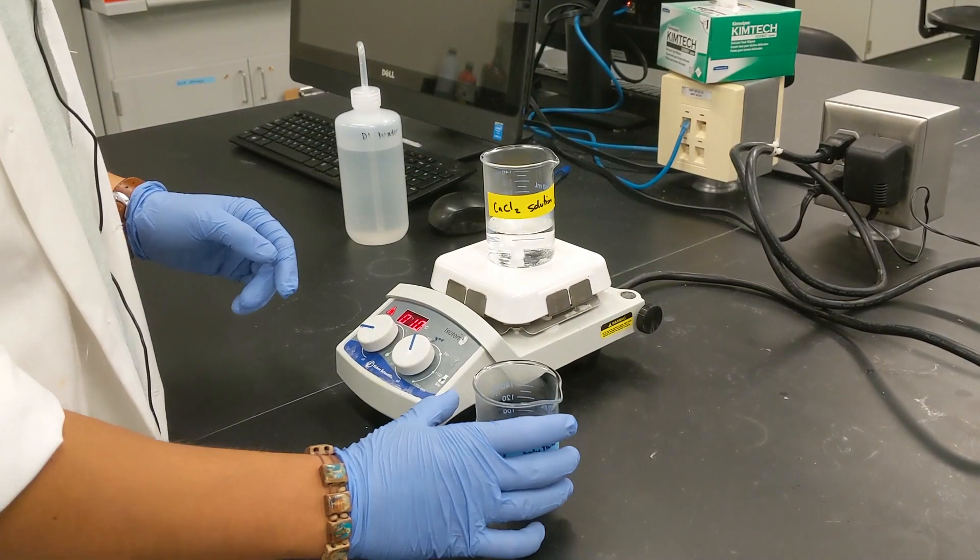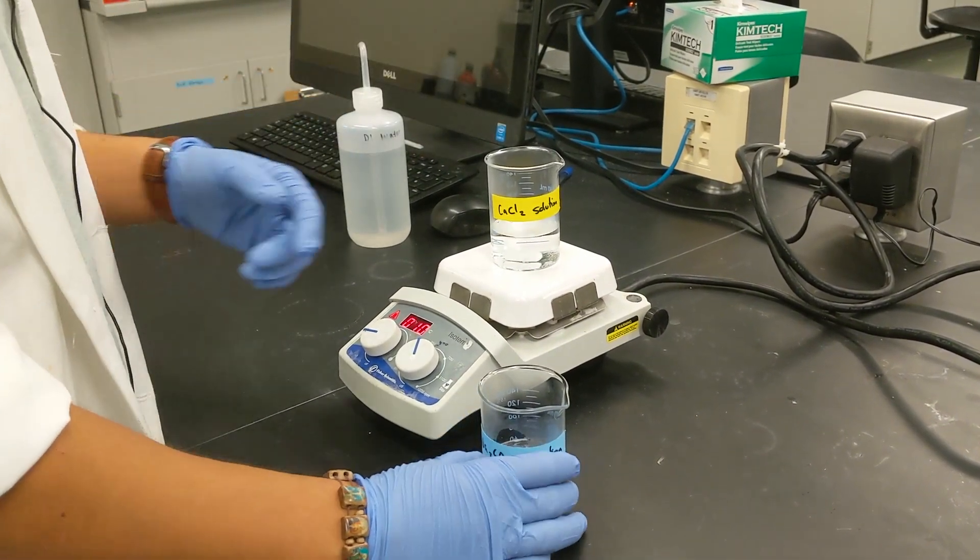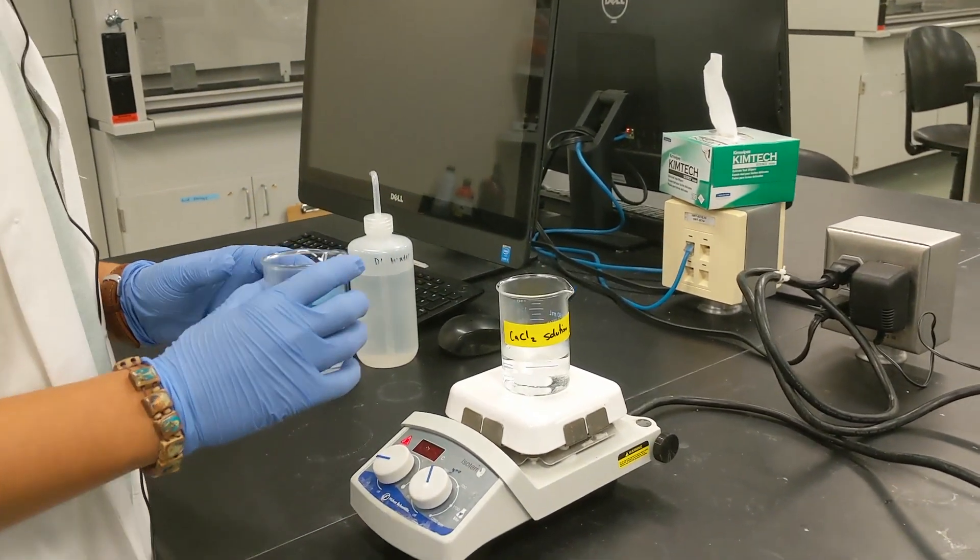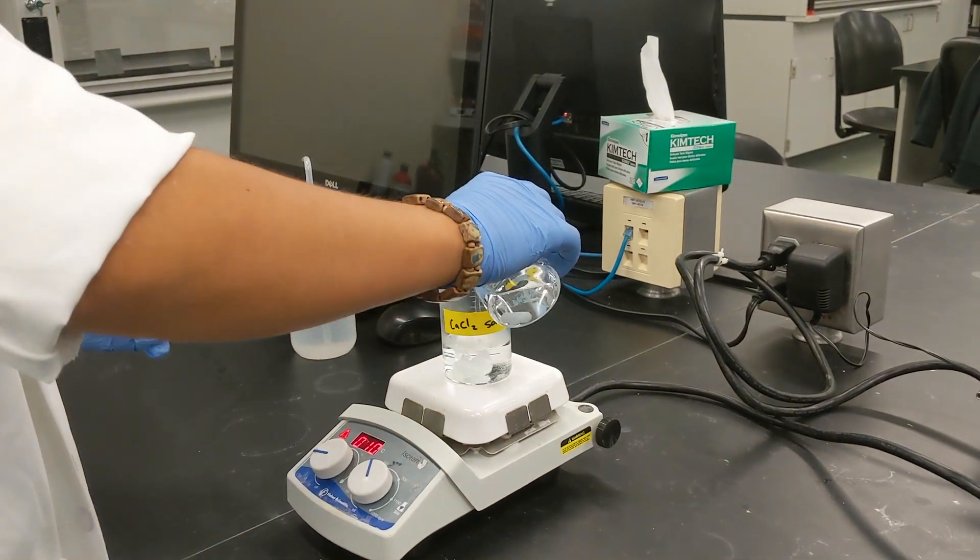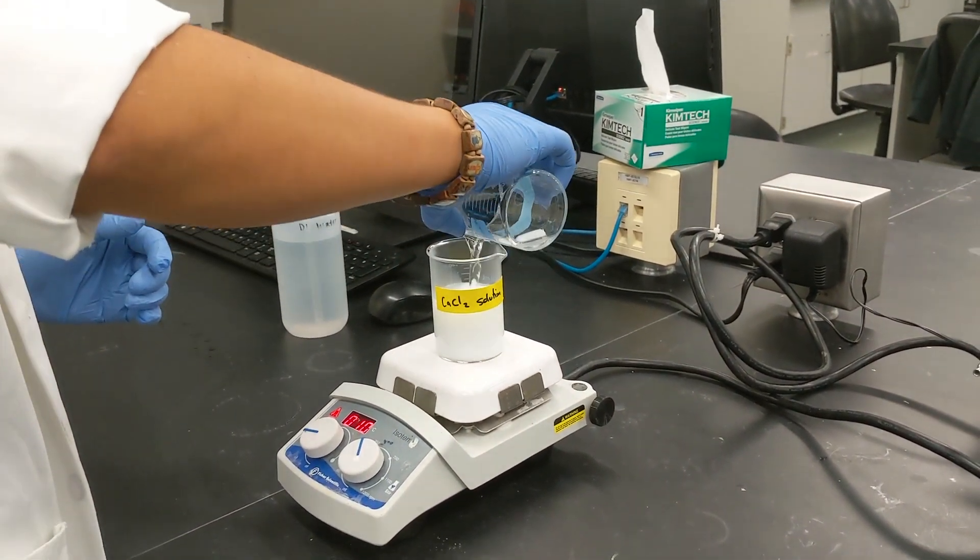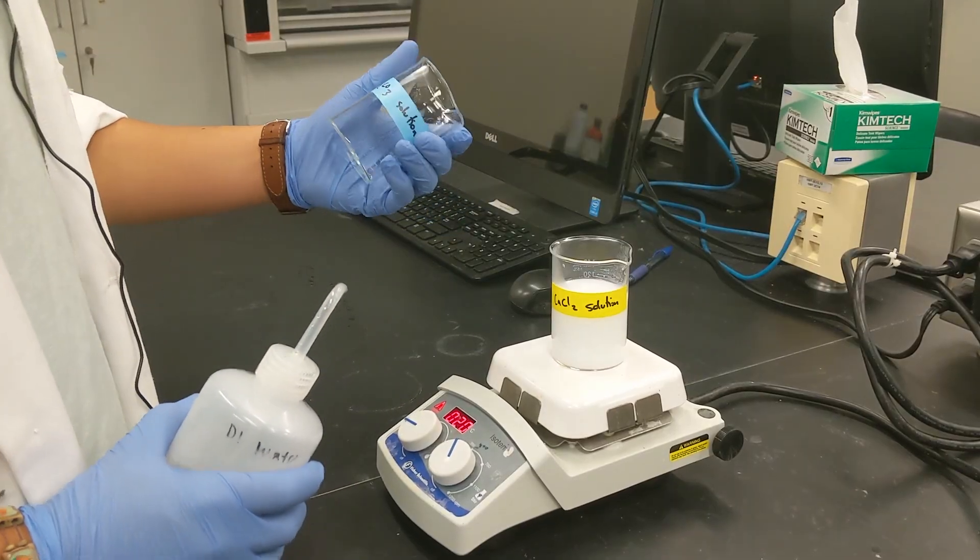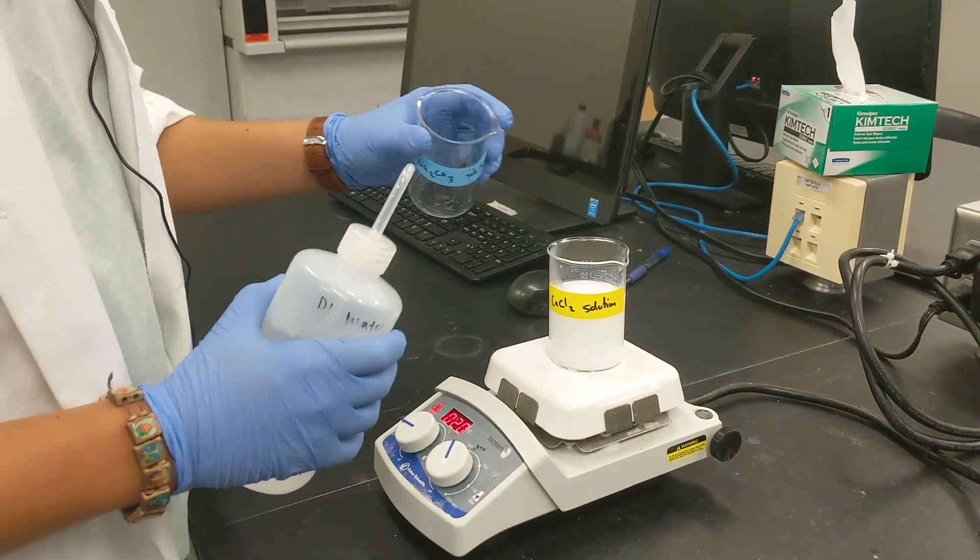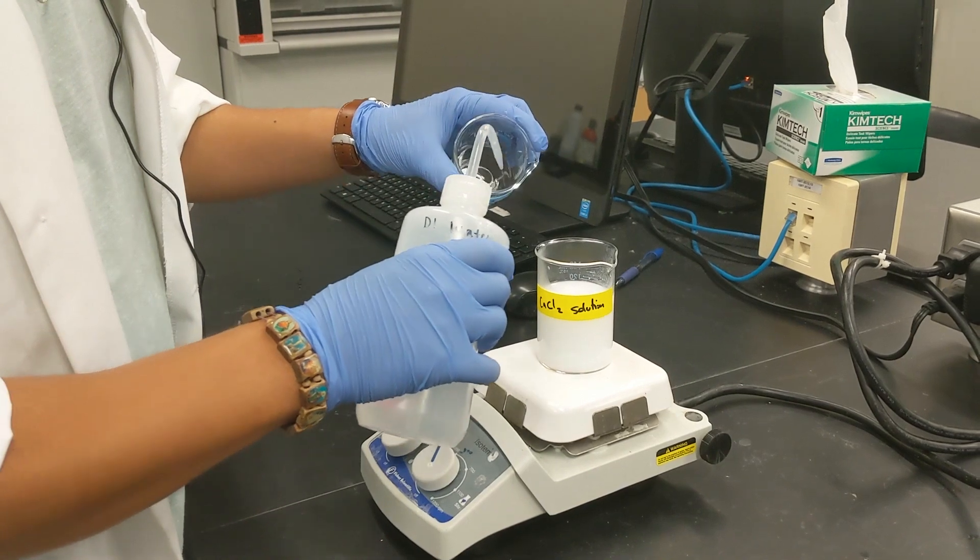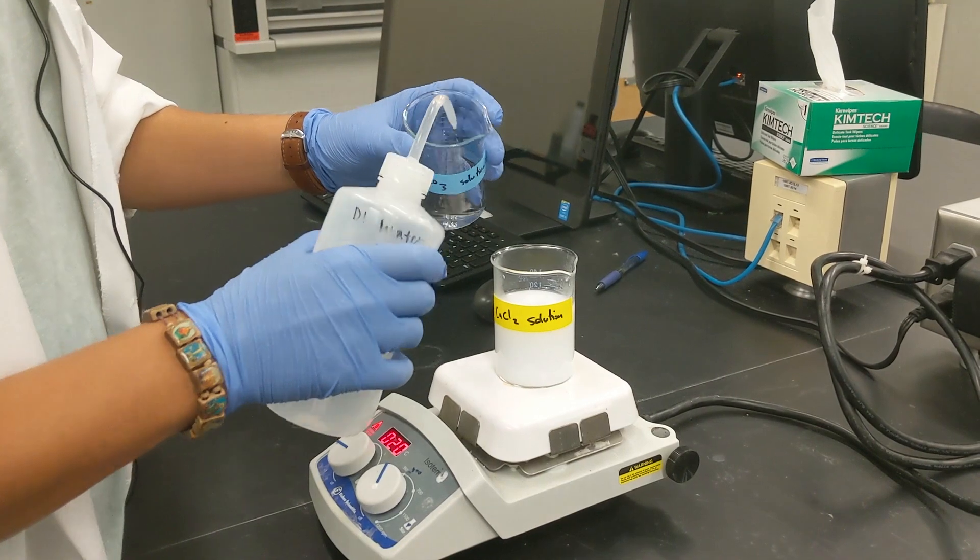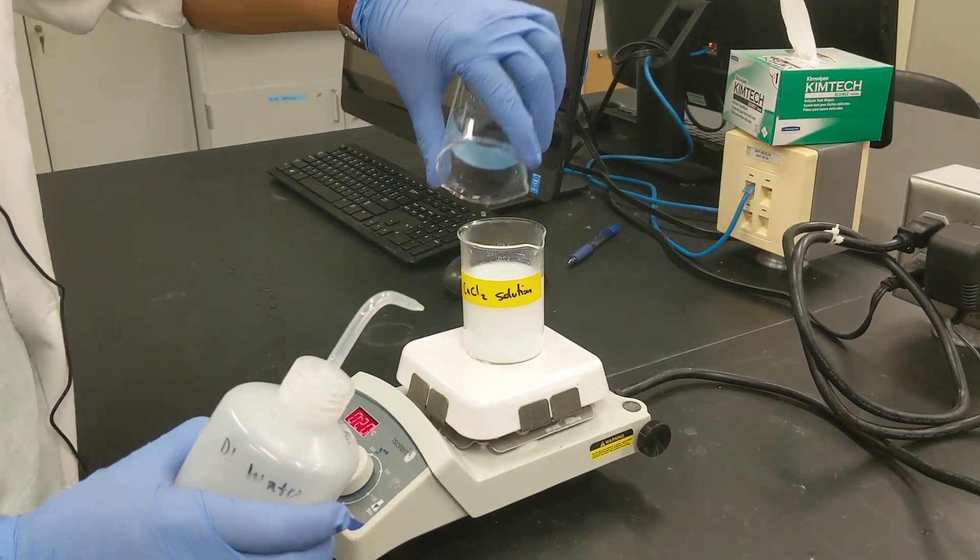So now our calcium chloride solution is finished dissolving. Our sodium carbonate solution is also finished so we're going to combine the two to form our precipitant. Make sure that all of the sodium carbonate got into the solution, we're going to rinse out the walls of it with some distilled water and then transfer that as well.